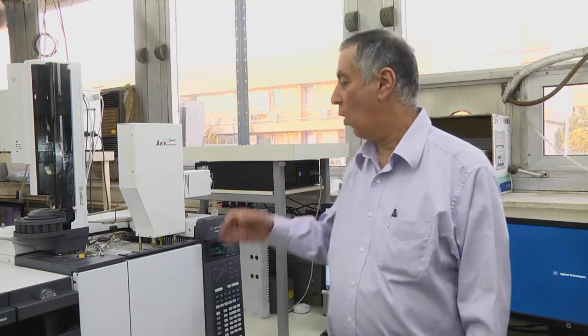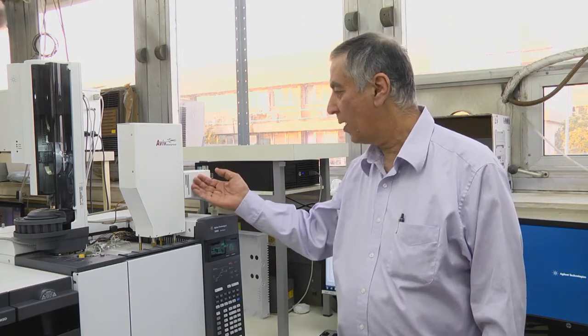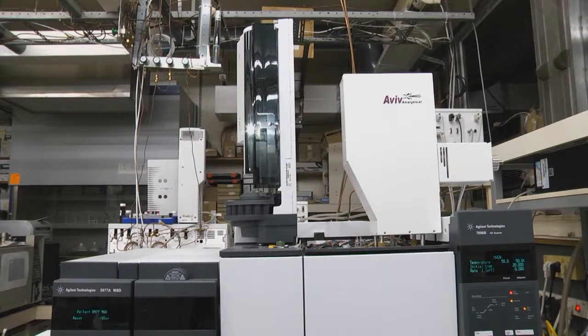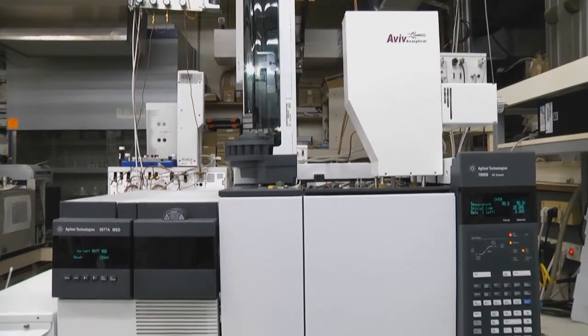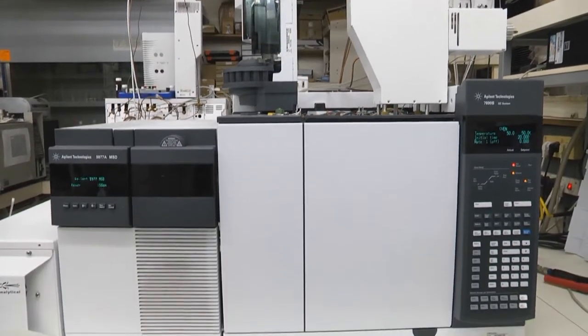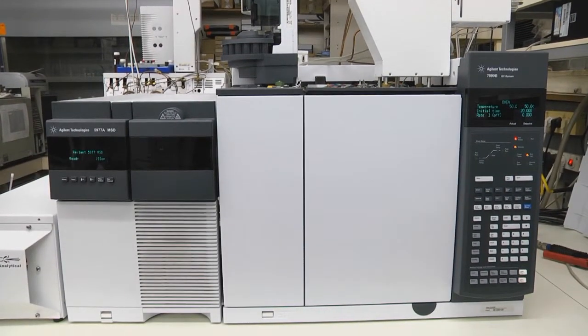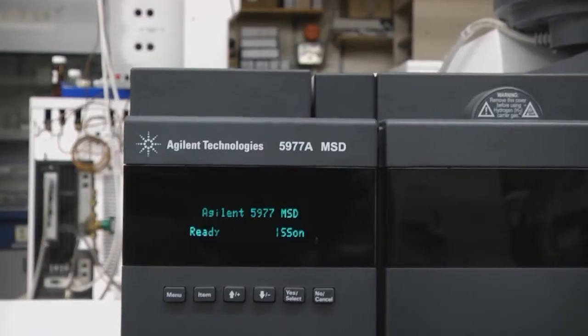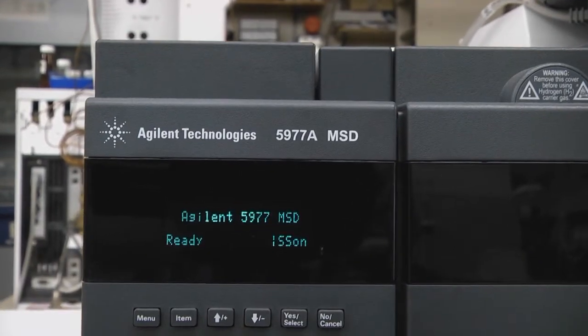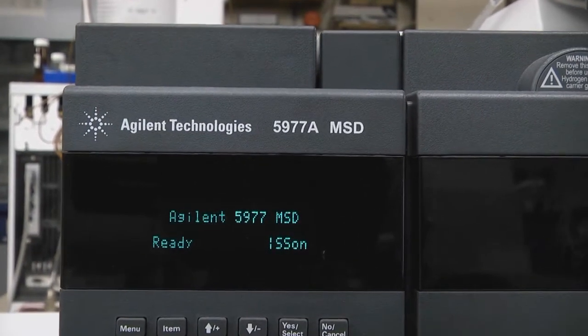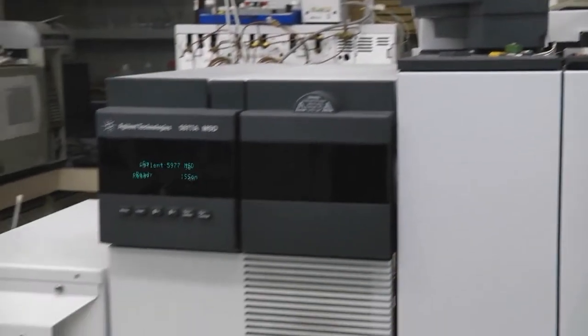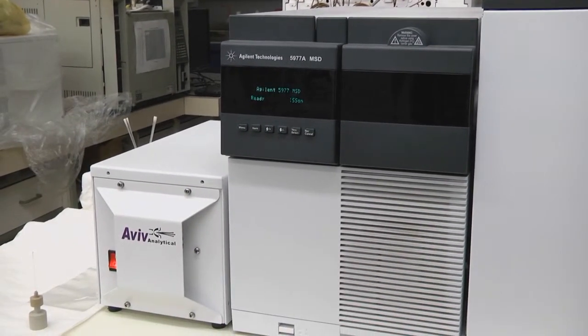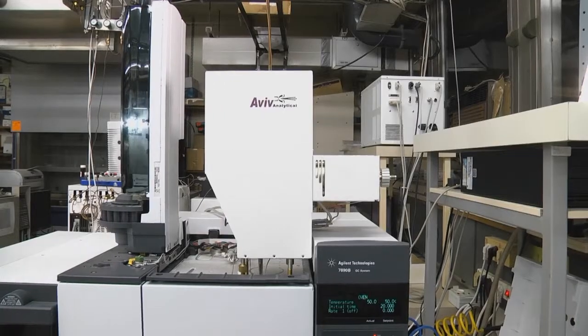This innovative new technology is based on the combination of OpenProb, FastGC, and MS of GCMS to form a powerful new tool for achieving real-time analysis, real separation, and library identification. The OpenProb FastGC is mounted on a standard Agilent 7890GC that is coupled with the Agilent 5977MS. Hence, it uses the low-cost single-quad mass spectrometer of GCMS.